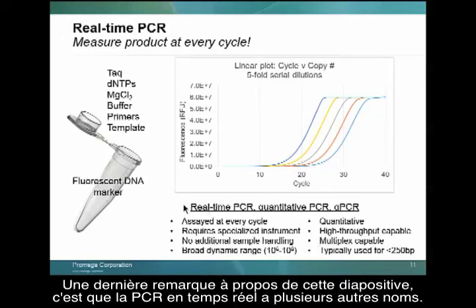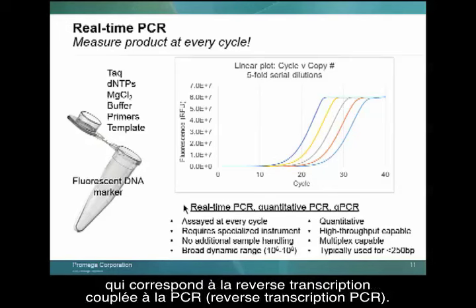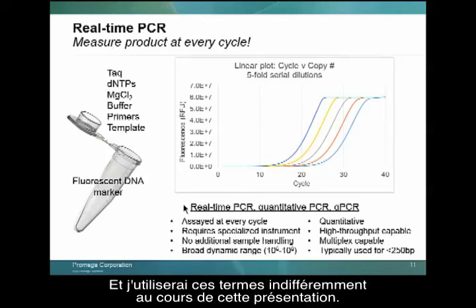And the last thing I want to point out on this slide is that real-time PCR goes by a number of names. You should not confuse real-time PCR with RT-PCR, which is reverse transcription PCR. But we do often use real-time PCR interchangeably with quantitative PCR or qPCR. And you'll hear me use those terms interchangeably during this talk as well.